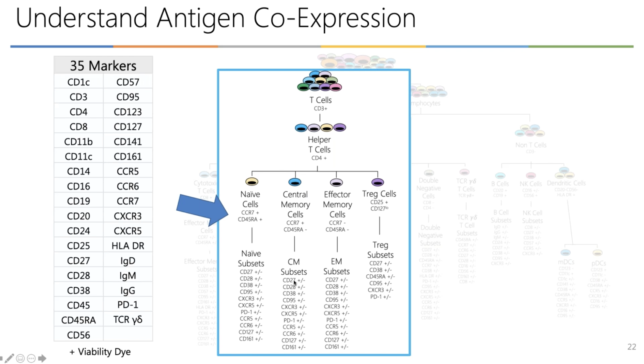I have a very clear understanding of what markers I'm going to be looking at, and that all these markers can be co-expressed on the same cell types or in different subsets. And I need to use that information when it comes time to panel design. So again and again, the biology is the foundation, is the starting point. We have knowledge of certain areas of biology. If you have come with something that we don't know, we are going to encourage you to spend time together researching and finding this information before we do anything regarding panel design.